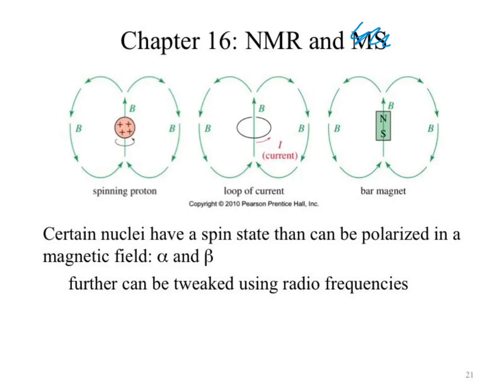What's happening in NMR is you take a really, really big magnet and you use that really big magnet to look at the magnetic effects of each of your nuclei. So a nucleus potentially has a magnetic moment associated with it. So what happens if you bring that magnet near another magnet? Do they have an effect on each other? Yeah, we can detect that effect. Okay, so that's the intent of the instrument.